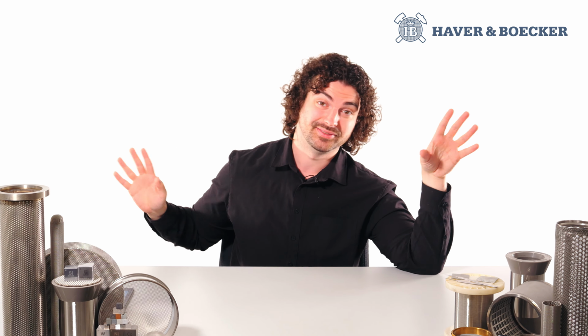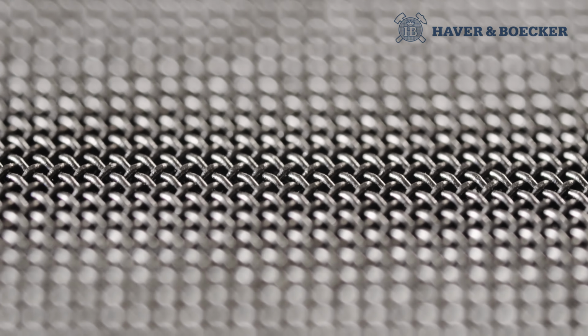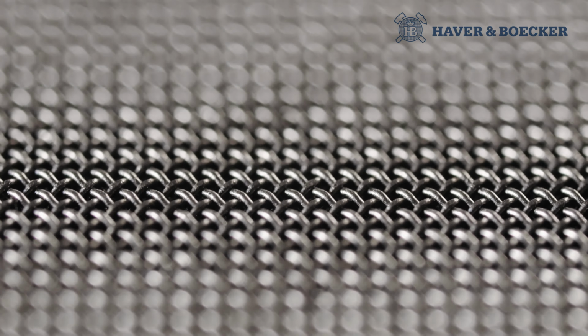Channeling occurs when the mobile phase finds the path of least resistance through the packed bed, creating rapid microstreams that bypass the stationary phase. This disrupts mass transfer, leading to split peaks, asymmetrical shapes, and a total loss of separation power. Channeling typically originates from uneven flow distribution or physical shifts in the underlying bed support. Weak spots or inconsistent pore sizes create localized velocity variations that cause the resin bed to shift, crack, and form gaps that erode the surrounding structure.